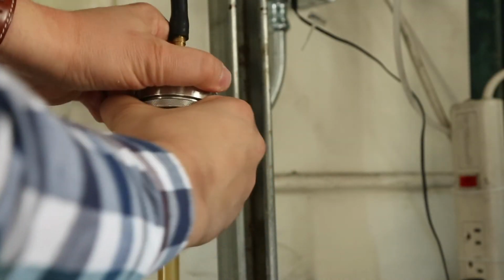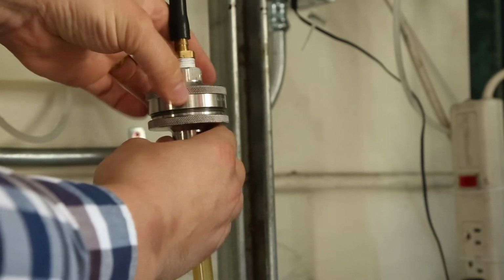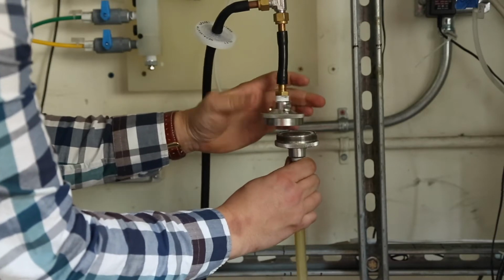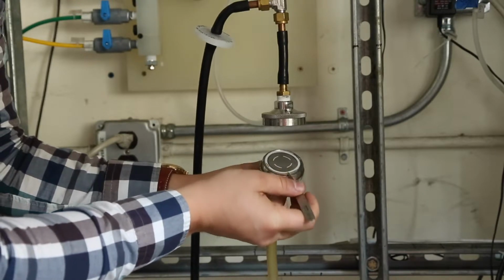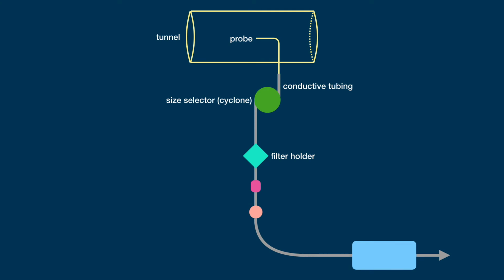As the aerosol stream passes through the filter, which is contained inside of a filter holder, it deposits more than 99% of the particles. The deposits of these accumulated particles are what will be weighed later to determine your cookstove's PM2.5 emissions. The process of weighing filters before and after testing is critical to the operation of a high-quality cookstove testing facility, and so for that reason, we've dedicated an entire future video just to that topic.